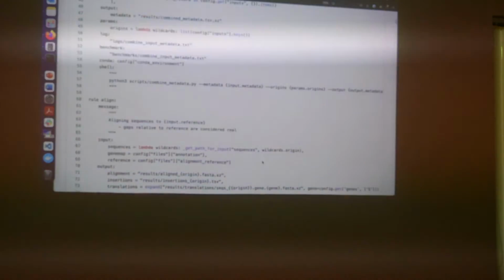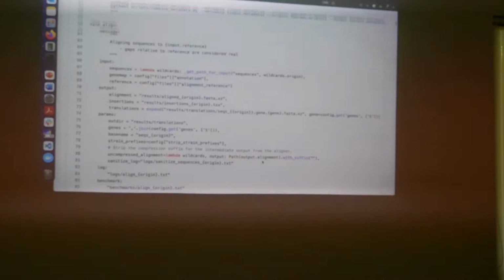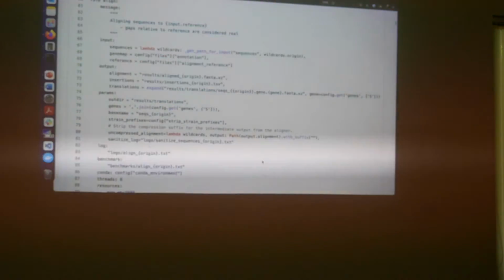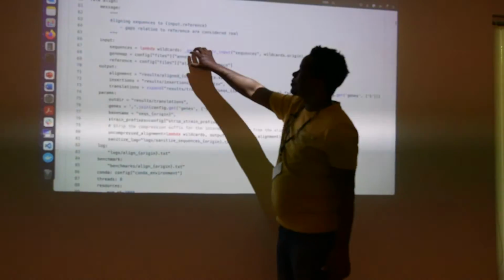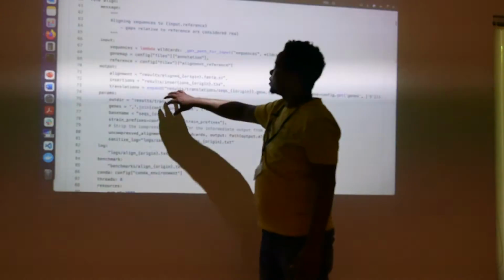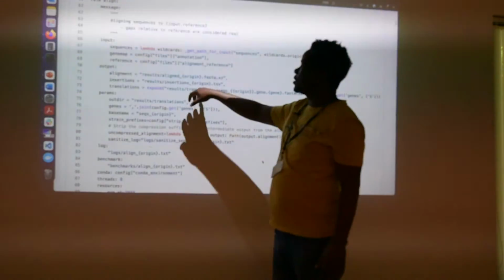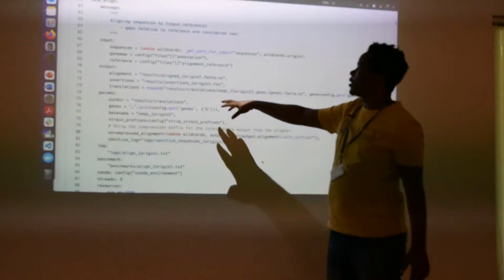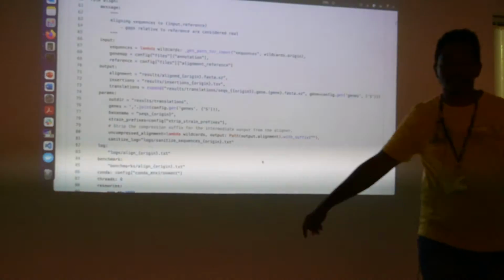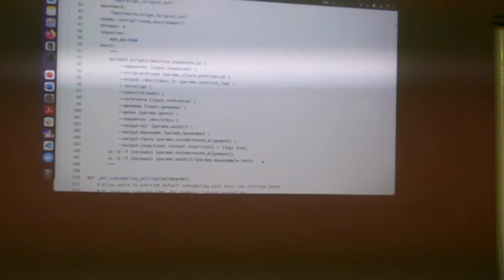and it's really nice. It shows the alignment, a rule align, where you're aligning your sequences, reading all your sequence data using these scripts here, the configs, where to write your outputs in the results folder, and you can see something similar to what we were learning today, and all the params in here, the log files, benchmark, and the threads and resources.